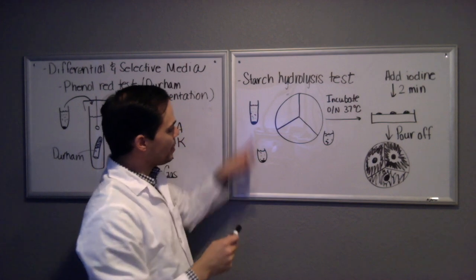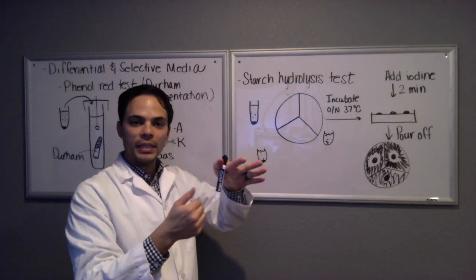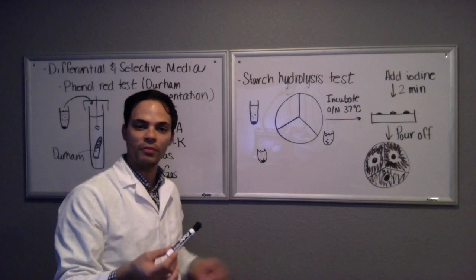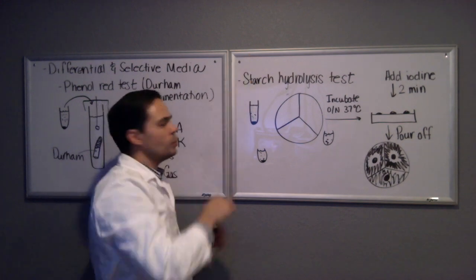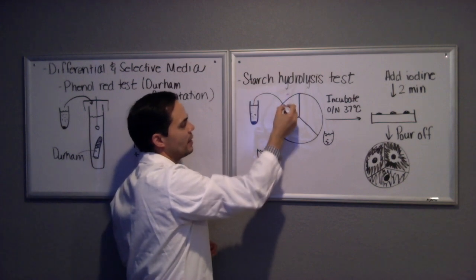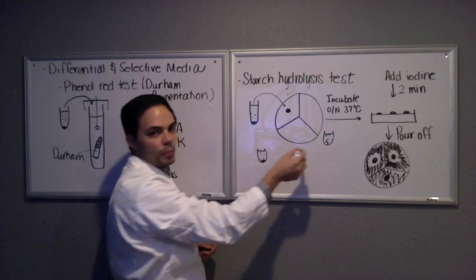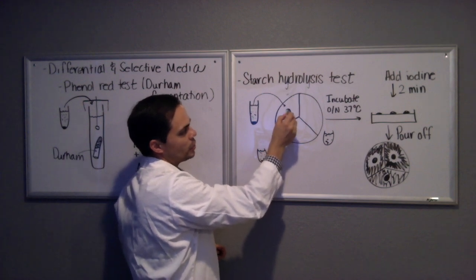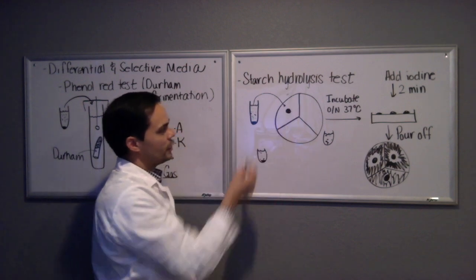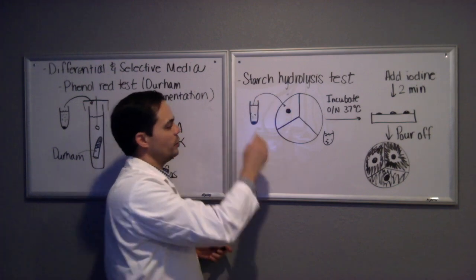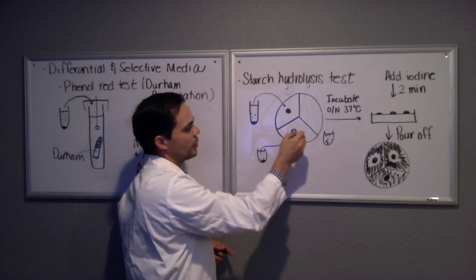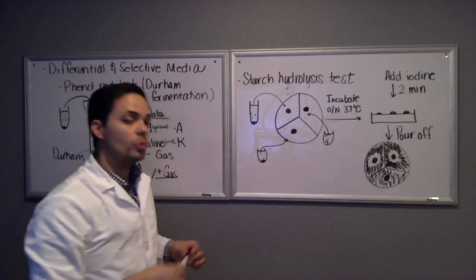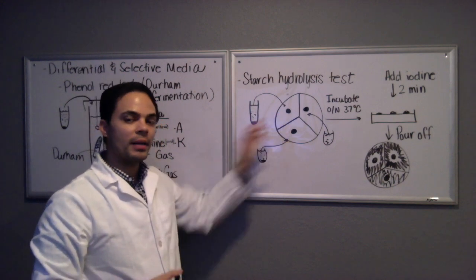What you would want to do is go from your three separate cultures of overnight cultures. Re-suspend any pellet that may be at the bottom by vortexing the tube so that there's a uniform distribution in the tube. Using aseptic technique and working near your flame, flame the loop, cool it, go into the first one and transfer that. The pattern you want to do for this is to make a little circular pattern like this for each. Then flame your loop, cool it, move on to the next one, and do the third one.